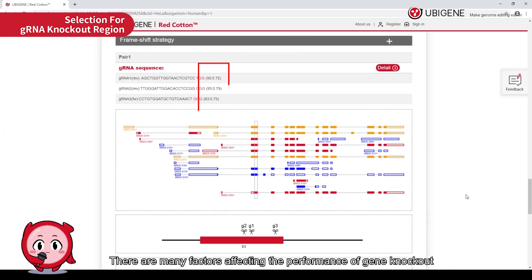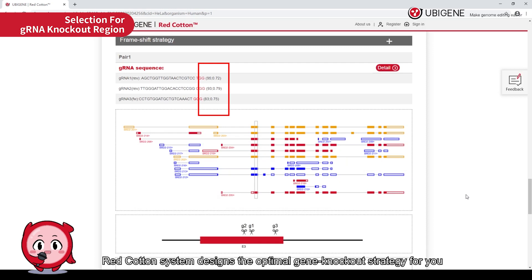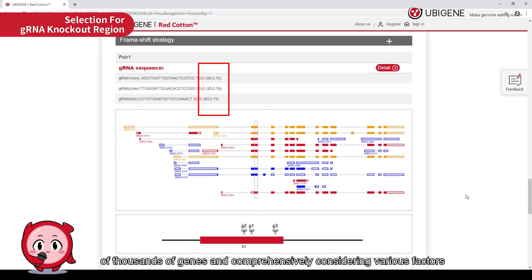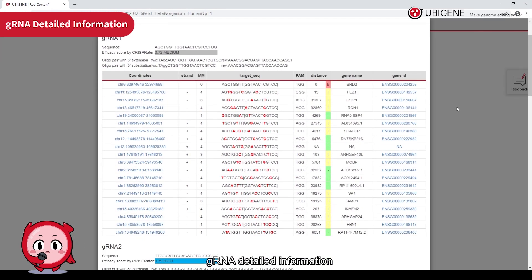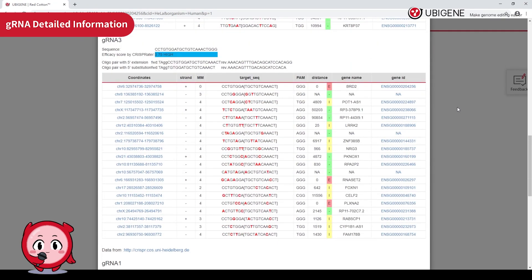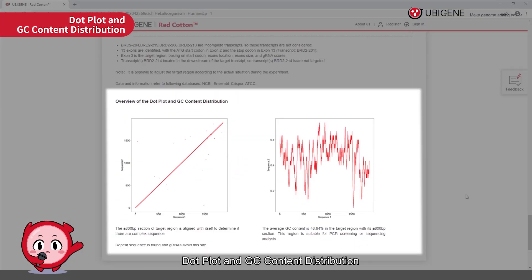There are many factors affecting the performance of gene knockout. Some gRNAs have a high specificity score but low coding efficiency, resulting in poor actual effect. The Red Cotton system designs the optimal gene knockout strategy by analyzing massive gene editing data of thousands of genes and comprehensively considering various factors, providing gRNA detail information, dot plot, and GC content distribution.